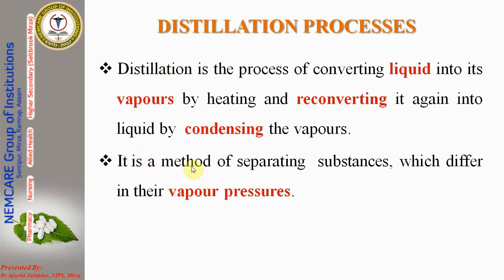So it is a method of separating substances which differ in their vapor pressure. If two liquids are mixed together, their vapor pressures will always be different, and that liquid can be separated by means of distillation, by doing the distillation process.